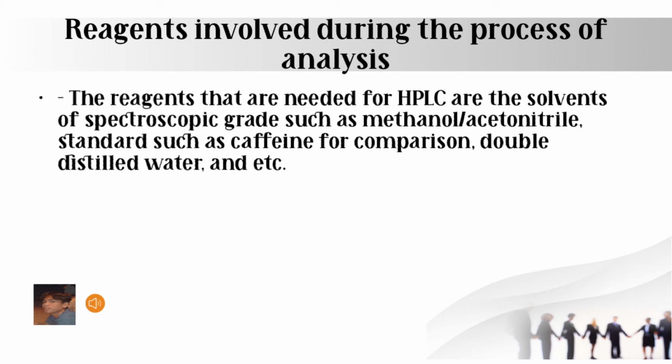Reagents involved during the process of analysis. The reagents that are needed for our analysis are solvents of spectroscopic grade, such as methanol or acetonitrile, standards such as caffeine for comparison, double distilled water, and so on.